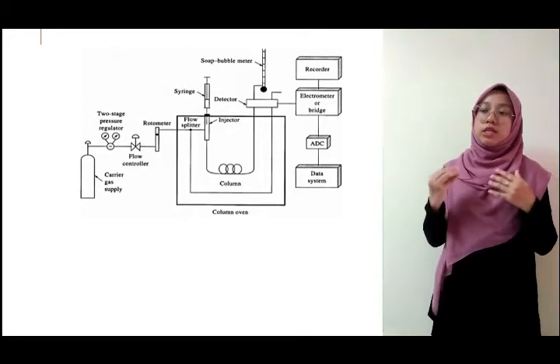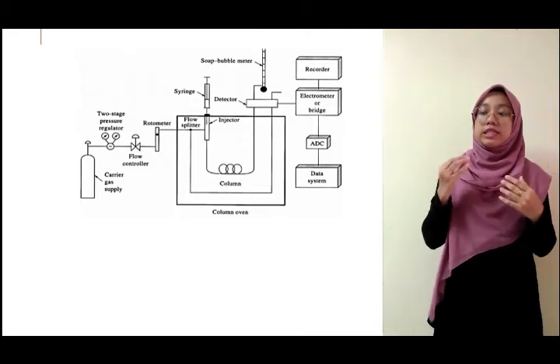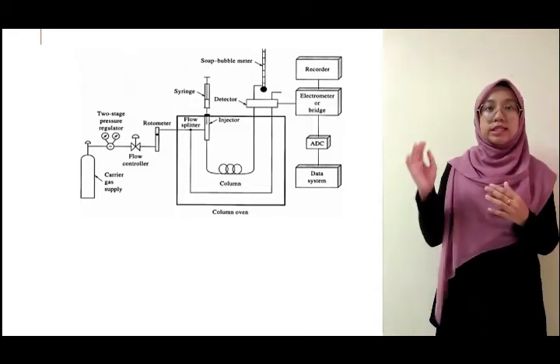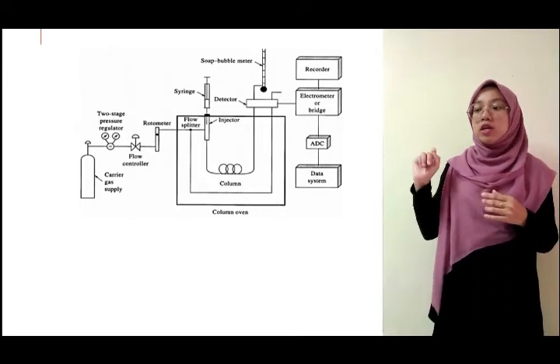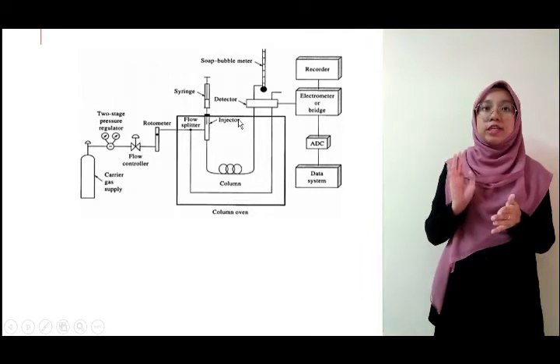Once the separation is completed, the detection is done with a detector attached at the end of the column. An example of the detector is FID, which is flame ionization detector.